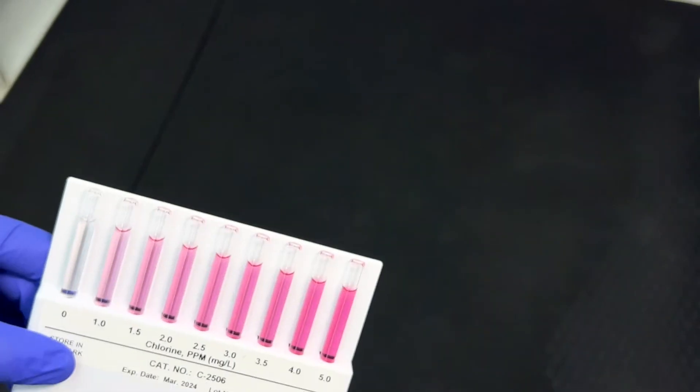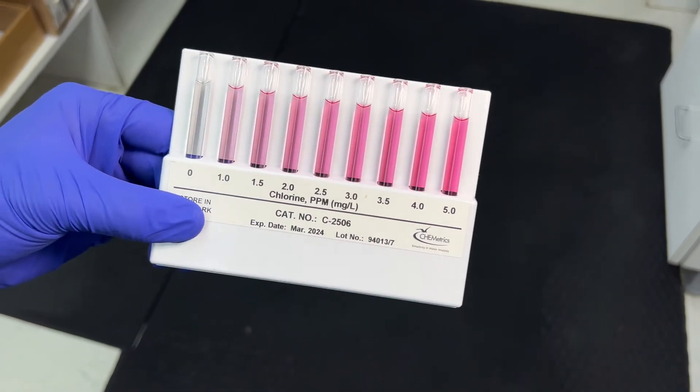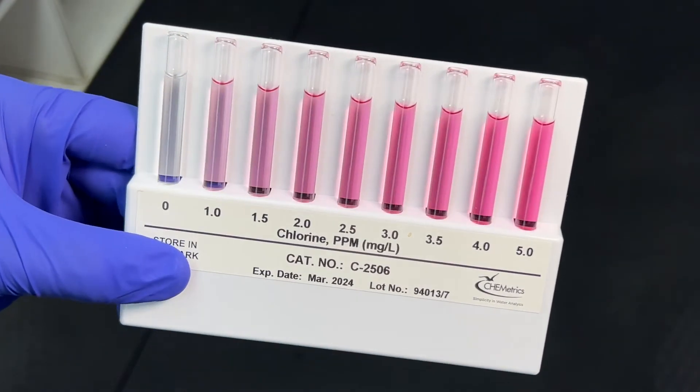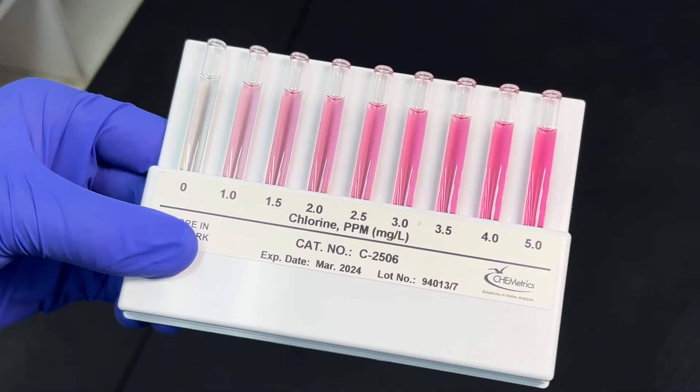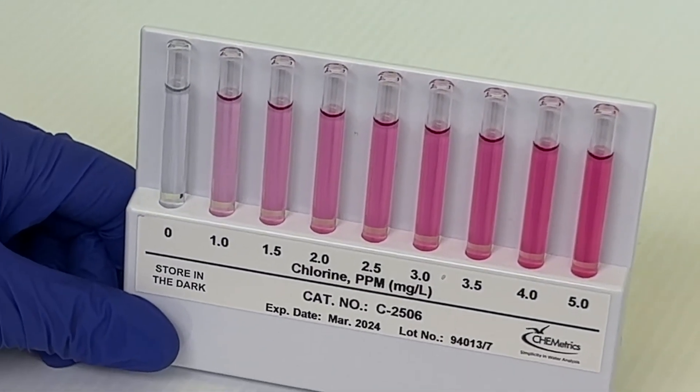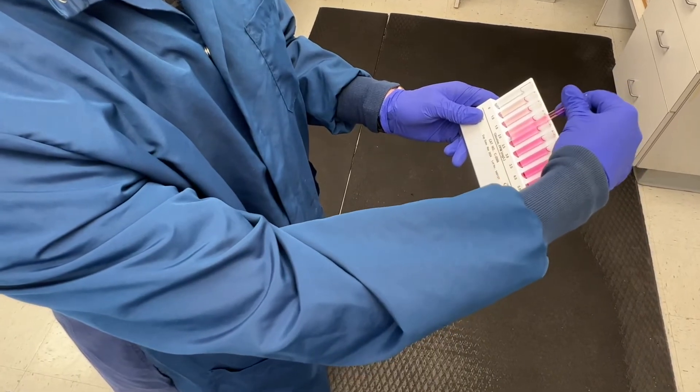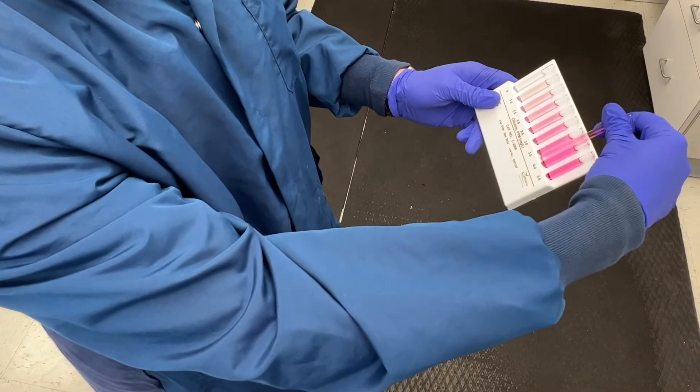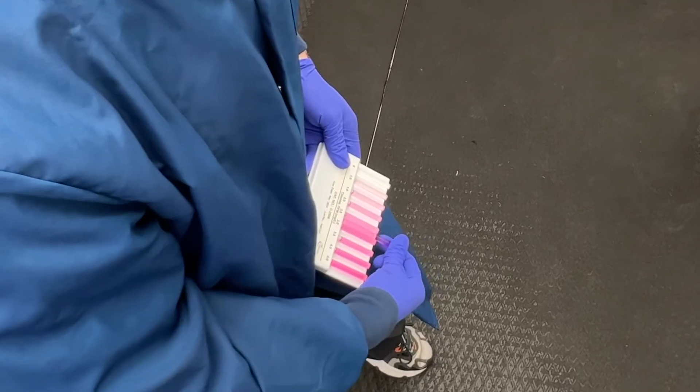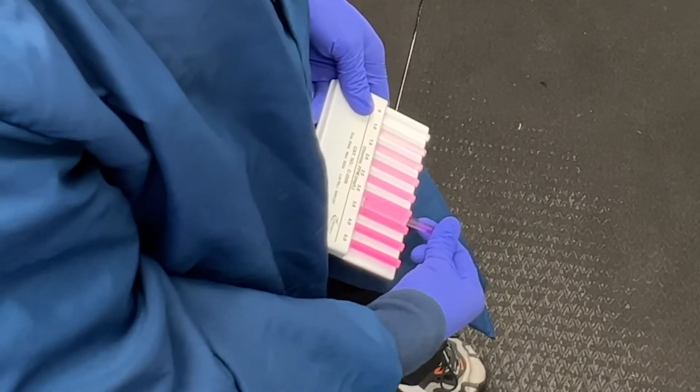When reading a high-range comparator, it's very important to hold it in a manner that eliminates glare or reflections from the light source. This can be accomplished by angling the comparator relative to the light source until the reflection disappears. Some analysts prefer to hold the comparator so the bubble is at the top of the ampoule. Others prefer to angle the top of the comparator down to make the bubble disappear into the body of the comparator, thus displaying longer stretches of continuous colors against which the test ampoule can be matched.